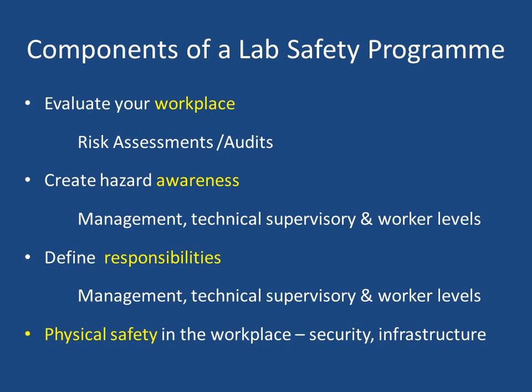At the management level, there may be no awareness of storage of volatile chemicals or the disposal of hazardous waste, etc. They need to be made aware so that they can provide the space and funding to ensure safety. Technical and supervisory staff need to be fully aware of the hazards in the laboratory space. Finally, workers, especially the housekeeping staff, need to be taught about safety issues.